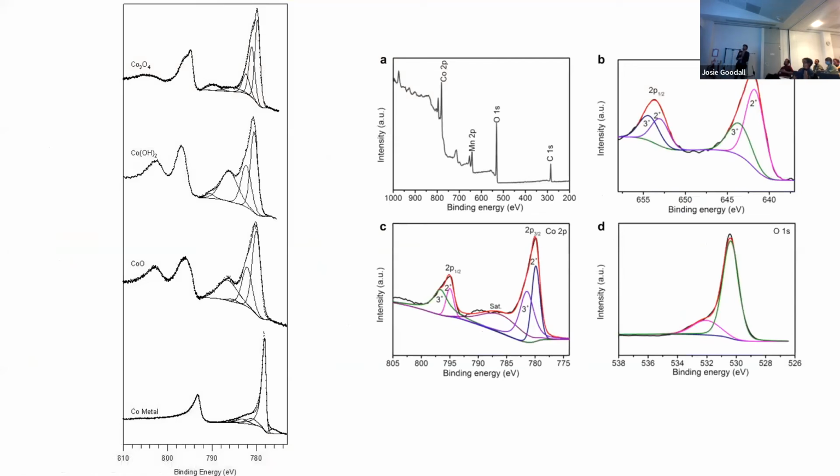But some people ignore that stuff. So we can see some cobalt peaks in panel C down below, and they've not bothered with measuring any standards, not bothered looking up literature or any of that kind of stuff. They just fitted a 2+, a 3+, and a satellite, which you can just use for anything, just to hide the rest of the spectrum you don't understand.